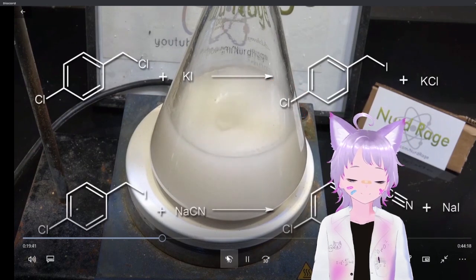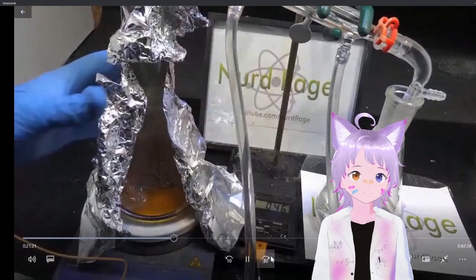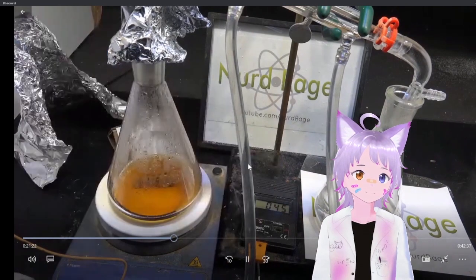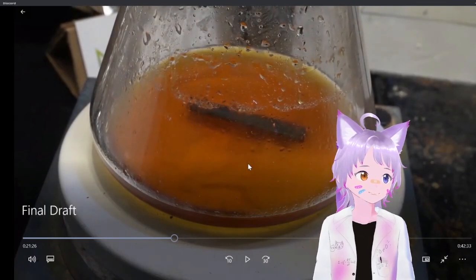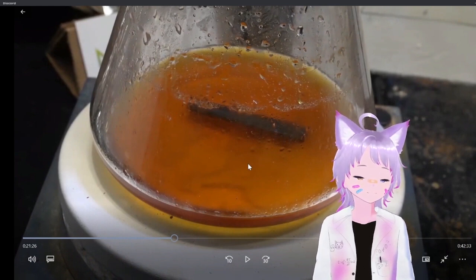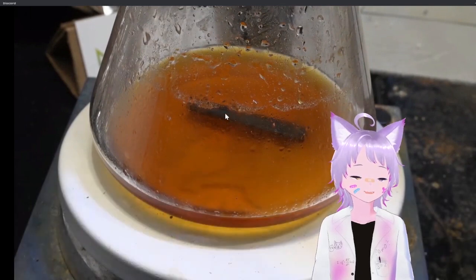Yeah, we already know that one. I know that step. That's pretty self-explanatory. So sodium iodide is a catalyst. Maybe the product is heat sensitive. Maybe that's why he doesn't want to use ethanol. It could be. Well, wait, let's play it. We'll find out. No, it's not. It's an organonitrile. Because remember, he did everything at once.